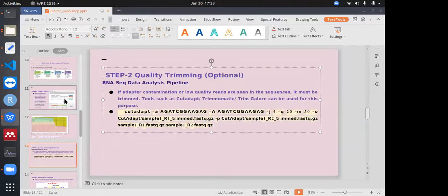All the tools that we use for NGS are Linux based or Mac based. That's why learning the CLI, learning the commands in the terminal, is extremely important, because we have to use these terminal command lines for the downstream processing.